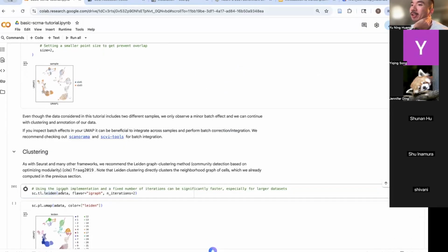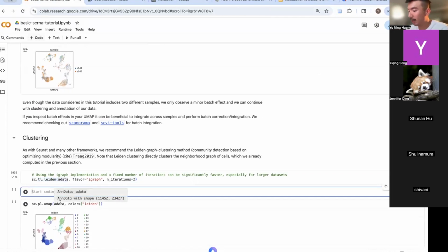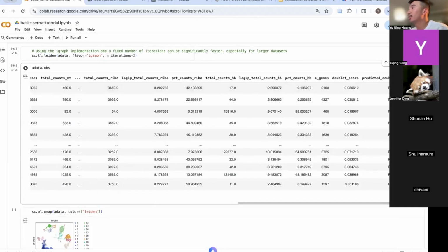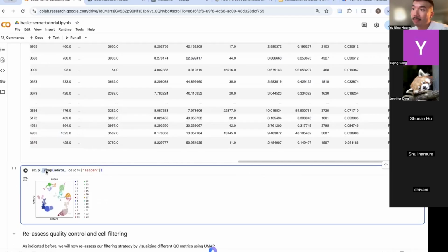So in this case, it will just help us identify different clusters here. If I finish running this, you can look at here, adata.obs. We would expect they add more information to the .obs layer. So they will have Leiden 0, 2, 3. They are just the identified clusters here. So I can use the scanpy.plotting functions and then use .umap. And then I want to plot the colors for Leiden. So in this case, I just identify 0 to 23.